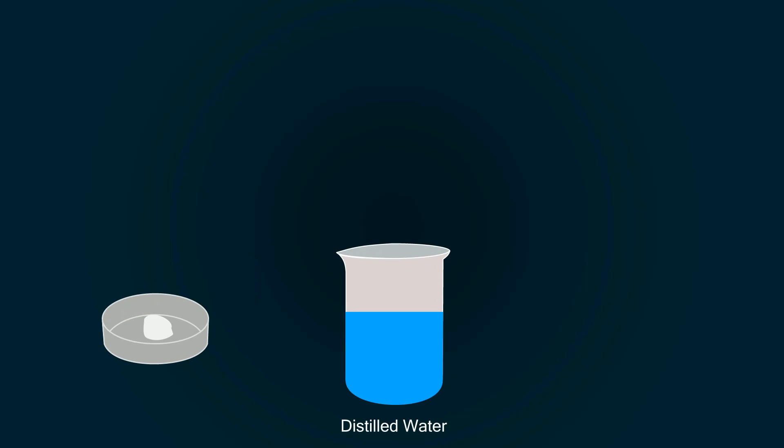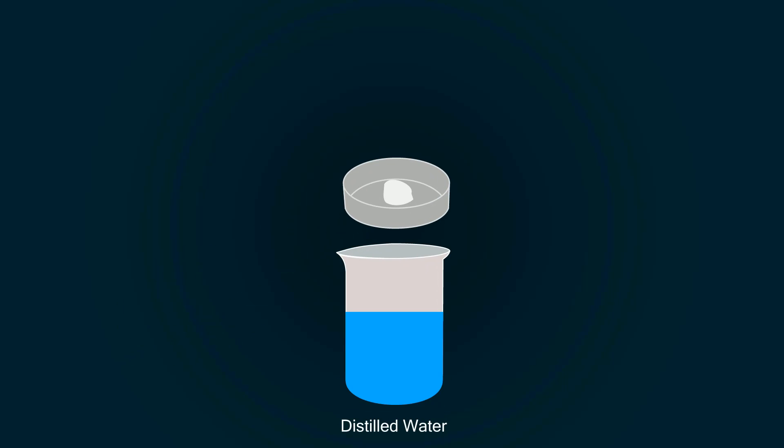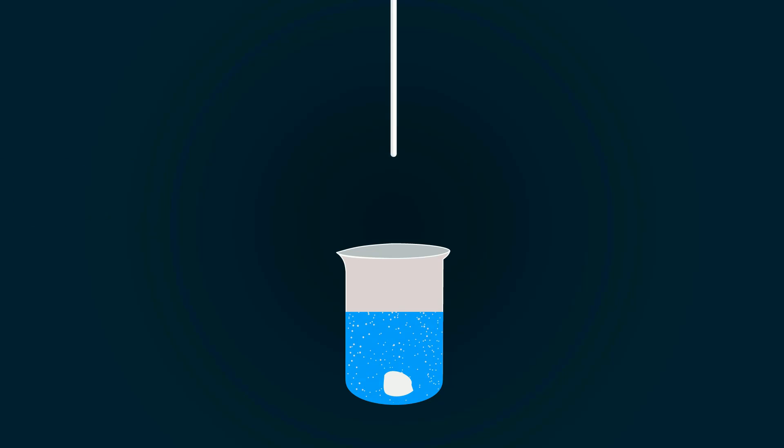Now add the silver nitrate into the distilled water. Mix it with the stirrer to make a homogenous mixture.